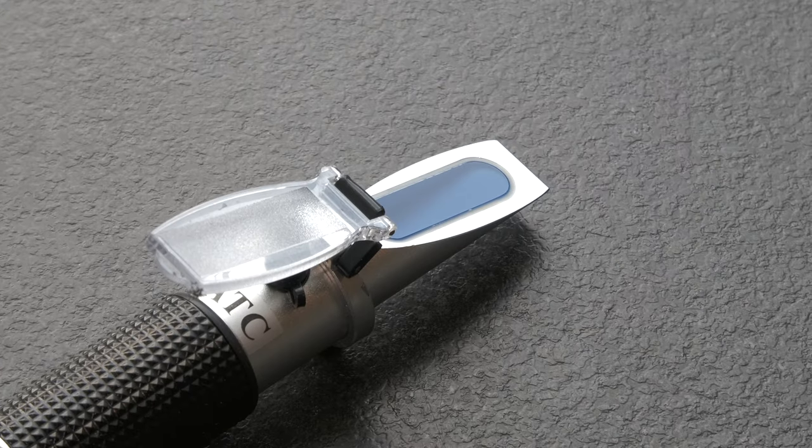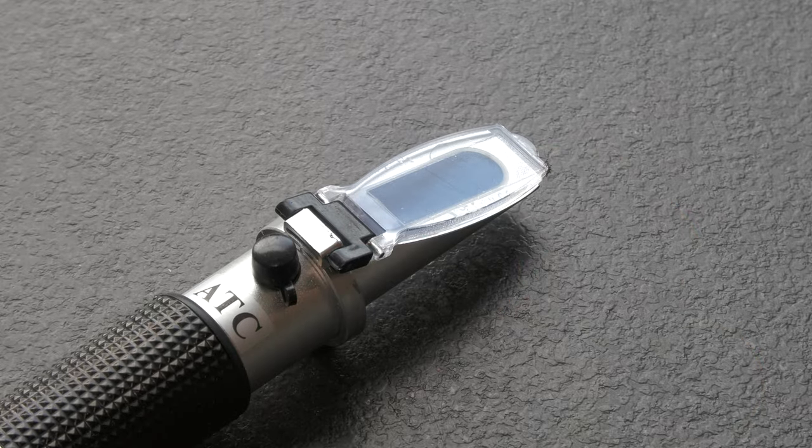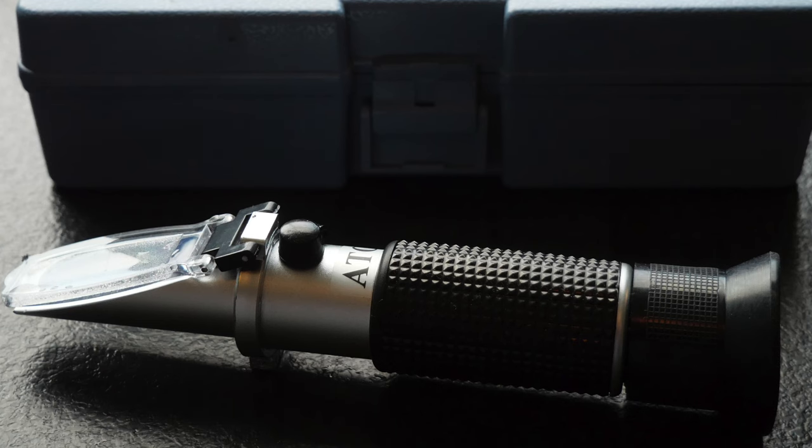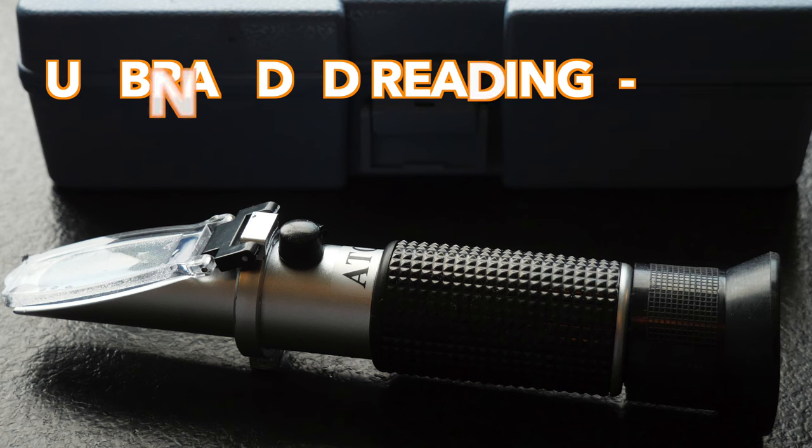As with the Sabre I applied a few drops of wort onto the sample area, which is also an angled prism, then added the gate ensuring there were no bubbles. As before it was not possible to get video or a photo of the reading, but it did come back as 1.036, which is 4 gravity points away from our benchmark. This was not a very surprising result for me, though it was on the higher side of the inaccuracy I have come to expect from these devices, especially considering we were on the lower side of gravity — more like a starter strength rather than a mid-strength beer — so this inaccuracy is likely to increase proportionally when measuring worts of higher strength.